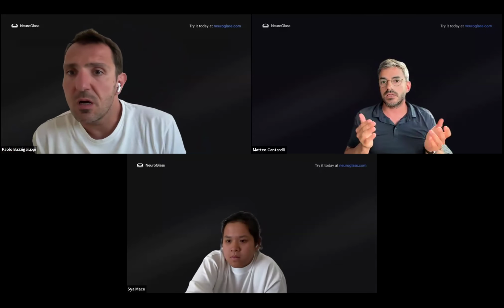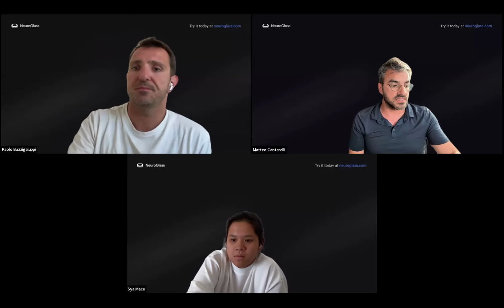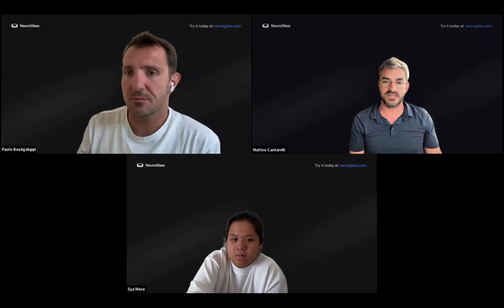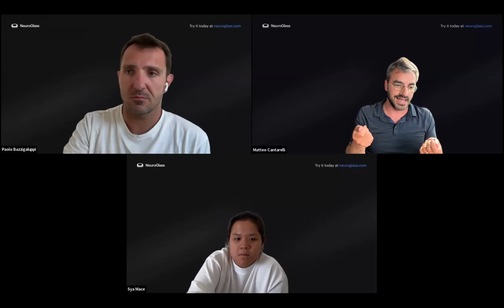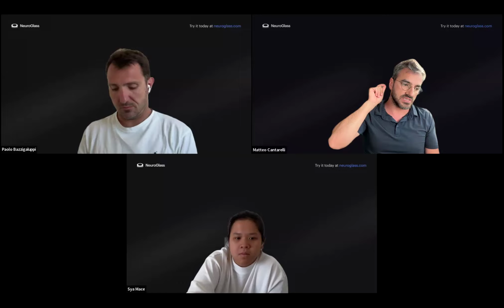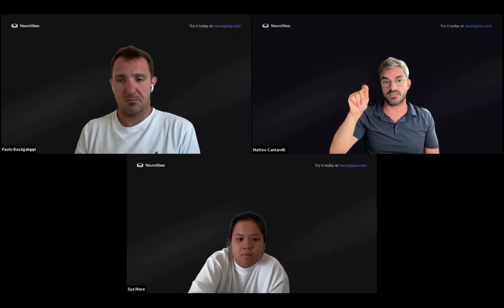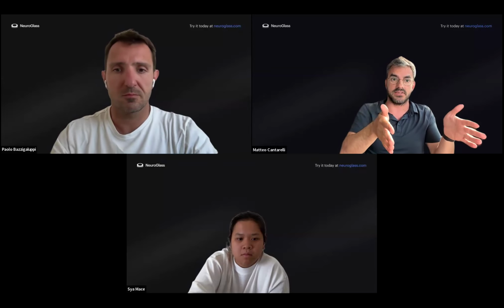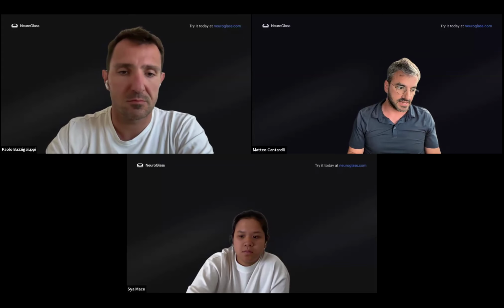We have another question. How easy is it to get data out of NeuroGlass? Yeah, it's as easy as getting data out of Neuroglancer from that perspective. We're not hiding anything. You can still go and look at the state in Neuroglancer through NeuroGlass, and you will be able to just copy anything that is there and paste it even in plain Neuroglancer, and things will just work. We have a copy compatible state that exists there as a feature.